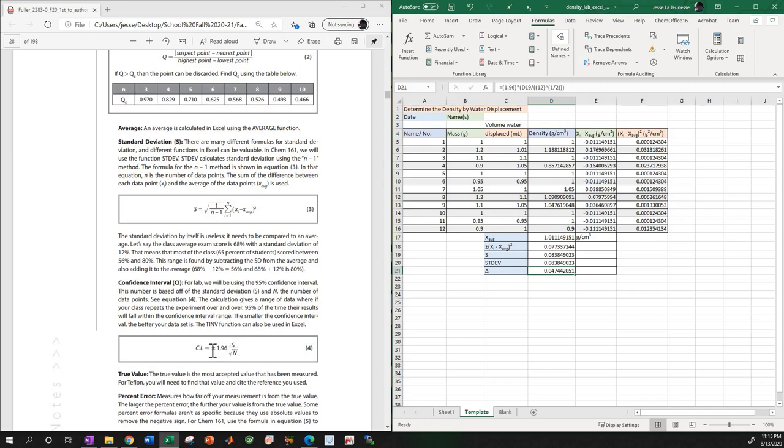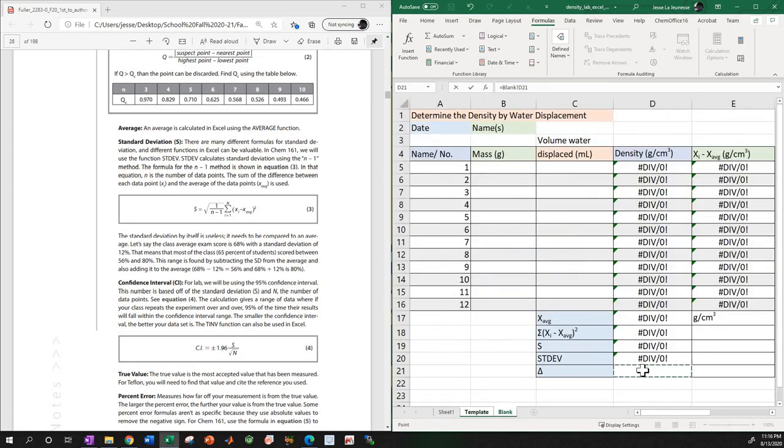We're essentially taking some confidence interval, plus or minus some value, with the standard deviation over the square root of the number of samples. So, I did this before already. I did the math language right here. And so, yeah, that's how we're going to do it in the other spreadsheet. In fact, I might even be able to copy. Excel does copying and pasting too. It makes things a lot easier.